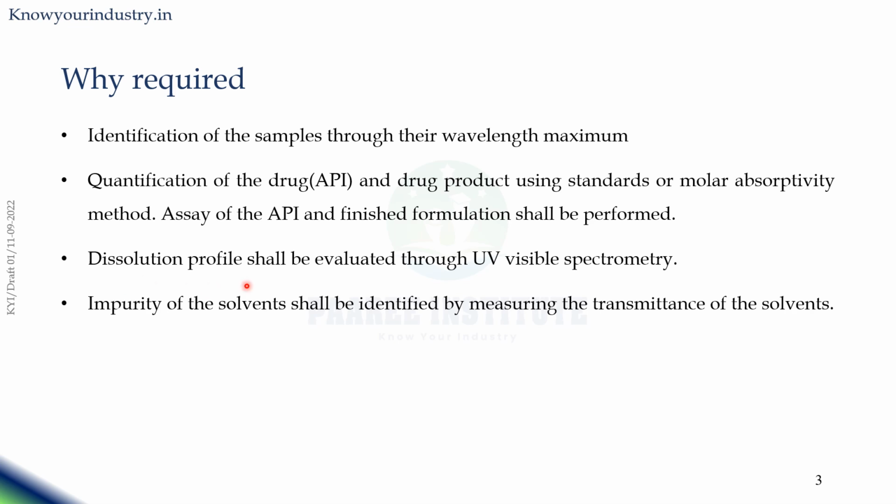Then also the dissolution profile will be evaluated for the solid dosage forms like tablets, capsules, pellets, etc. So the amount of drug released at each time point is assayed by using this UV visible spectrophotometry.